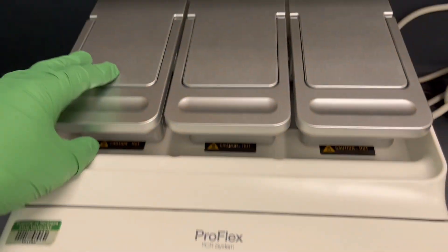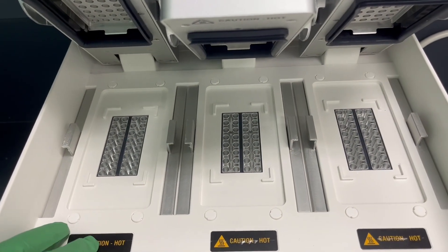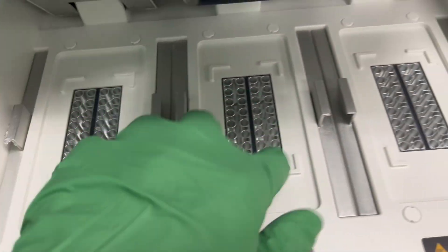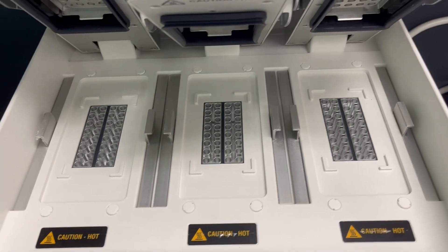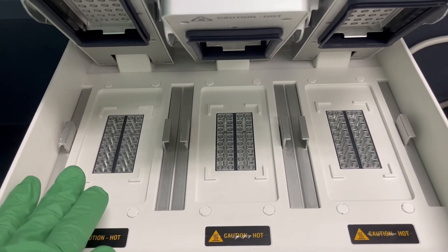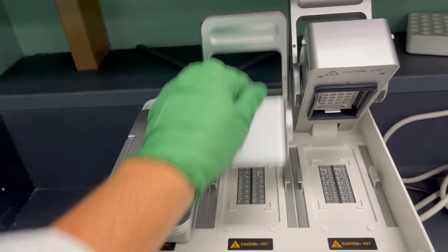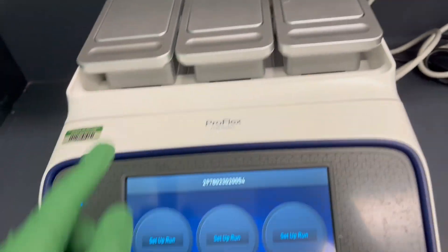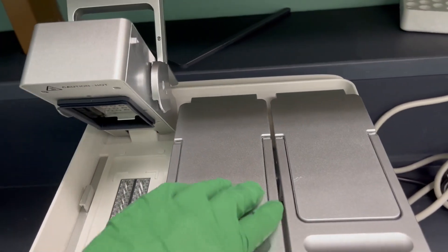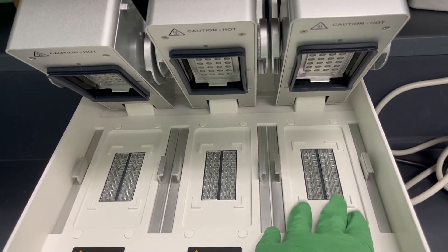In terms of the Veriflex property — being able to change temperatures independently — the ProFlex actually has even more zones than the MiniAmp. Each block, where you can see the line down the middle, gives you six independent zones which can all be set to different temperatures in the Veriflex setting. So this is a really interesting machine: three separate people could each run their own experiment independently, or if you're running your own experiment you can set up six different temperatures for a gradient or to optimize a protocol.